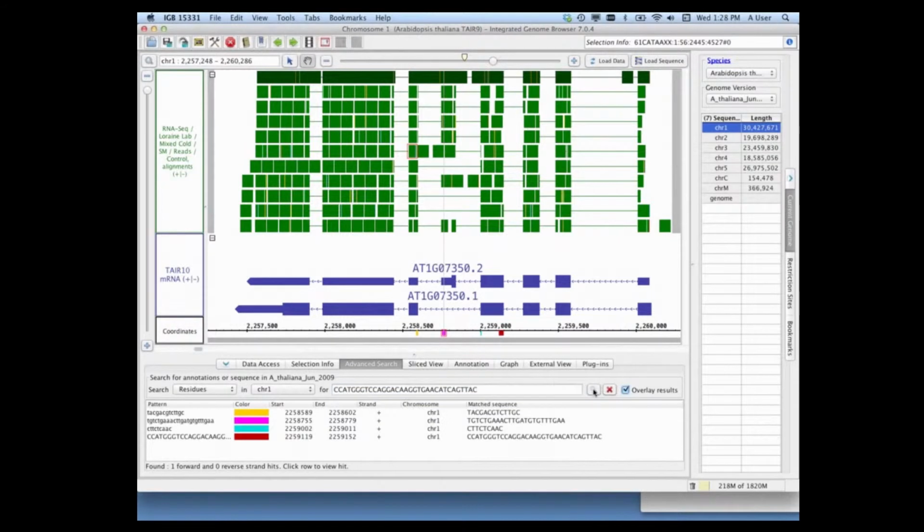And by using the sequence search overlay, I can actually map out all of the primers that are going to be part of identifying this area. And it's a great way to keep a record of it. It's also fairly useful if you have data that's loaded to know what your primers are going to pick up in your samples.